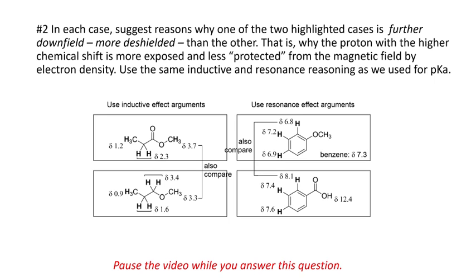Okay, here we go. This first one. Well, look, we got CH3. It's in the alkane region. There's nothing special about this at all. Next to that, we have one that's a CH2 that's to the left of 2. Well, that's because that CH2 is next to this carbonyl group. The carbonyl group is sucking electrons away from that carbon, de-shielding that CH2.